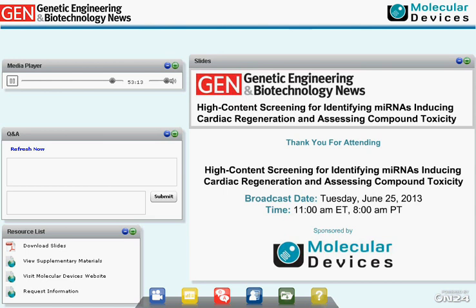All right, Evan, here's another one. How long do you have to incubate the cardiomyocytes to see beating? Well, that's actually the important one. When you plate the cardiomyocytes, at least the ones we're using from Cellular Dynamics, you'll see contractions in about 3 to 4 days. And then we typically wait 7 to 10 days to get very good regular contraction rates over the whole well. Some other researchers have been waiting 14 days and sometimes longer, and you do see an increase in the contraction rate if you let them mature longer. So there are some benefits to doing that, but again, we typically wait 7 to 10 days post-plating.